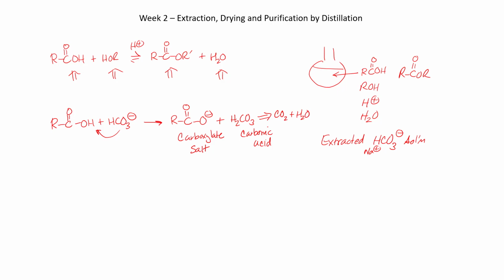So what we would have done is we would have taken our separatory funnel and we would have had 2 layers. We would have had the ester layer on top, and we would have had the water and probably some excess bicarbonate. And what would have happened is the bicarbonate would have reacted with the carboxylic acid, so any excess carboxylic acid down here would be formed as the salt. That's an ionic compound, and so as an ionic compound it would have been in the aqueous layer exclusively.